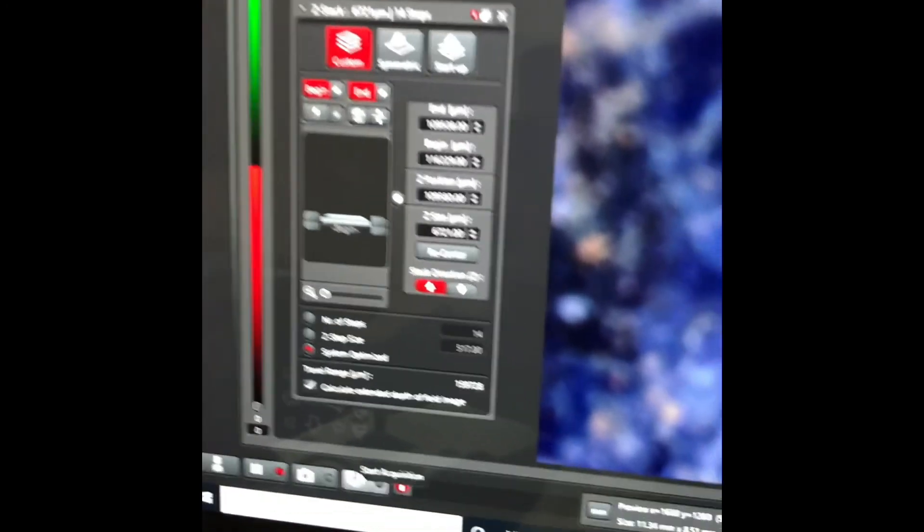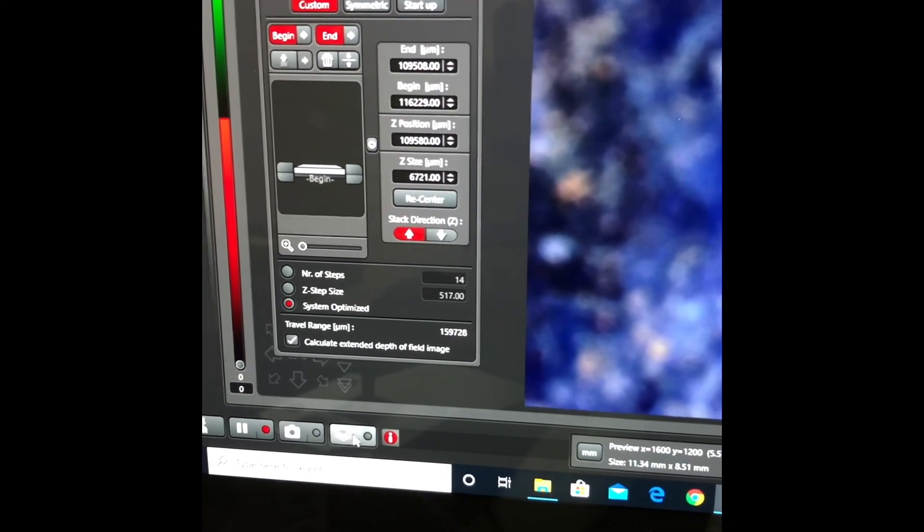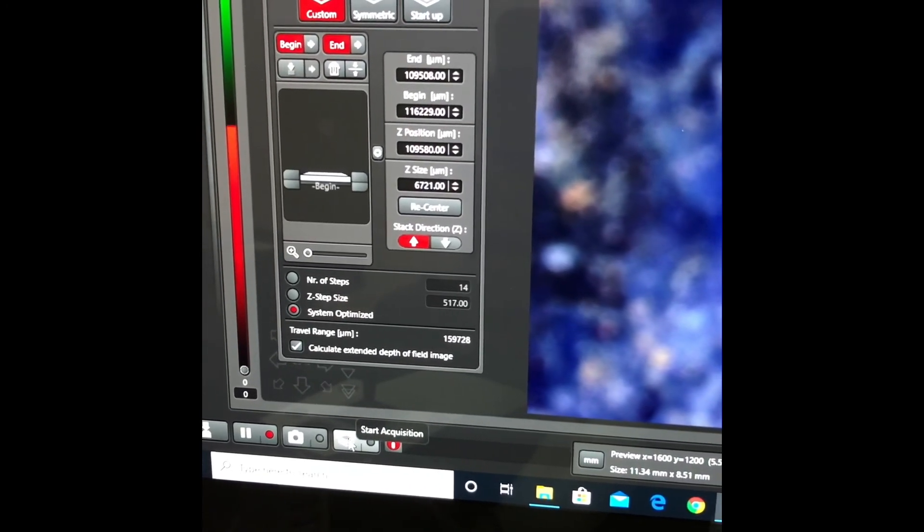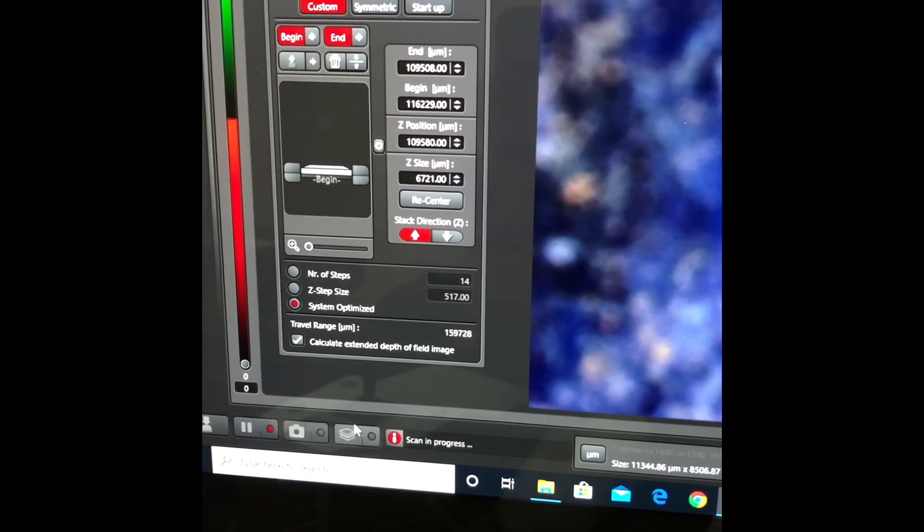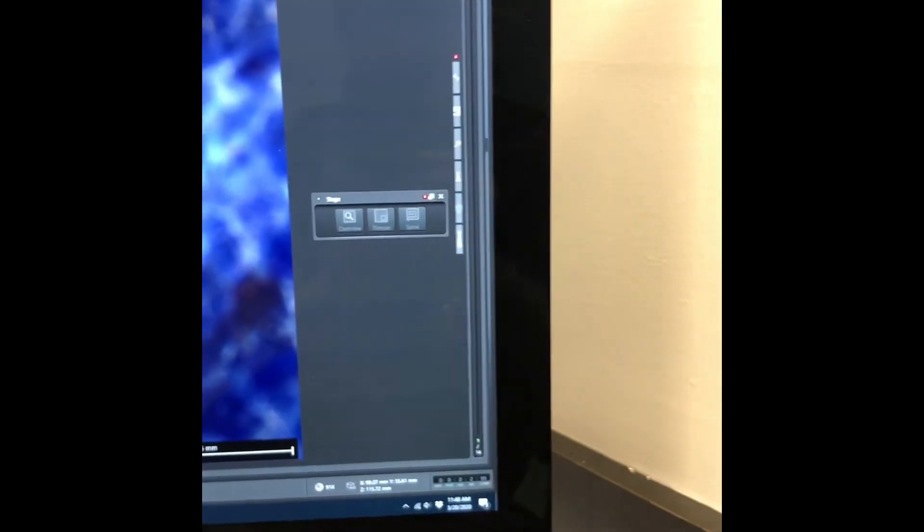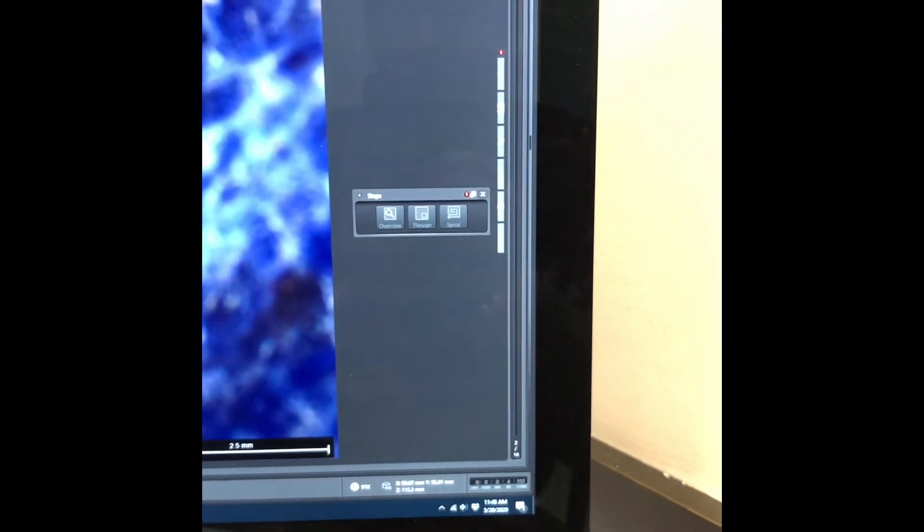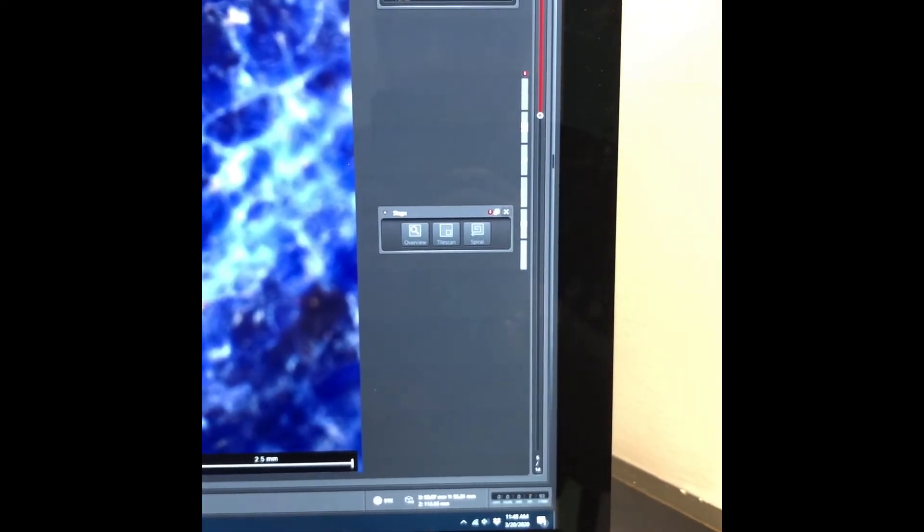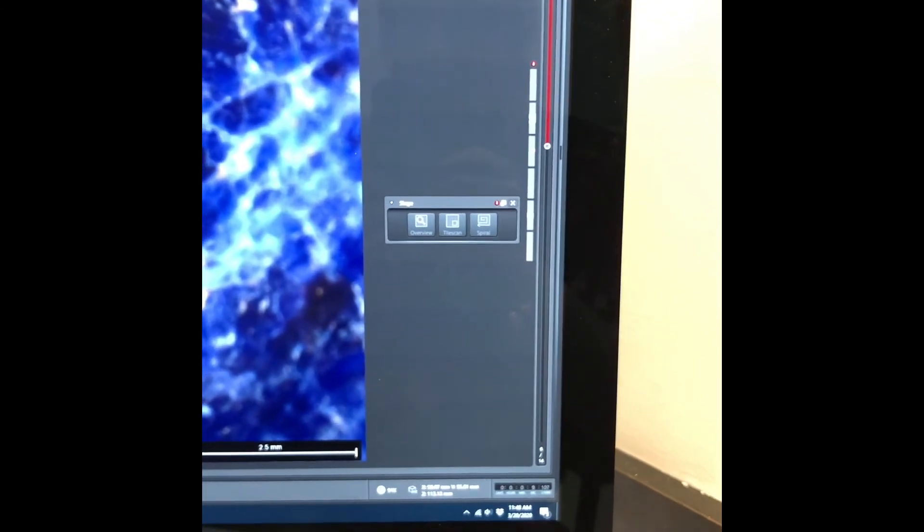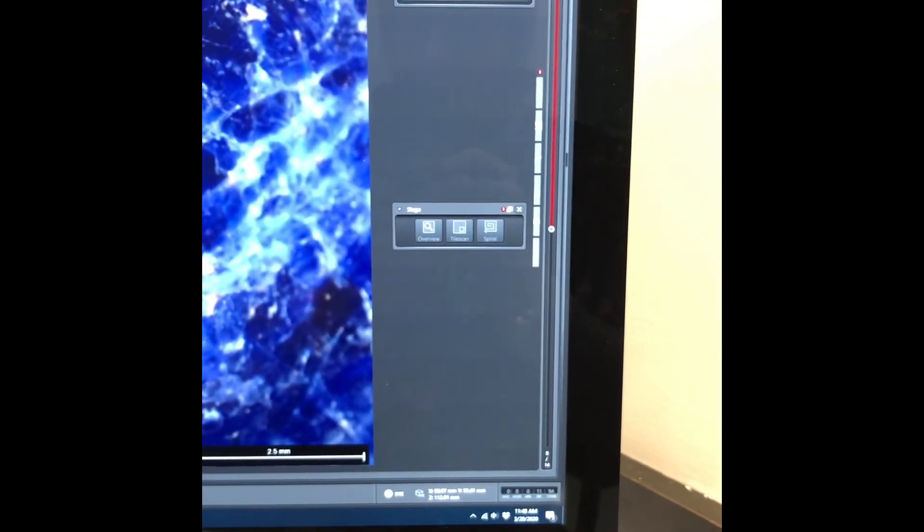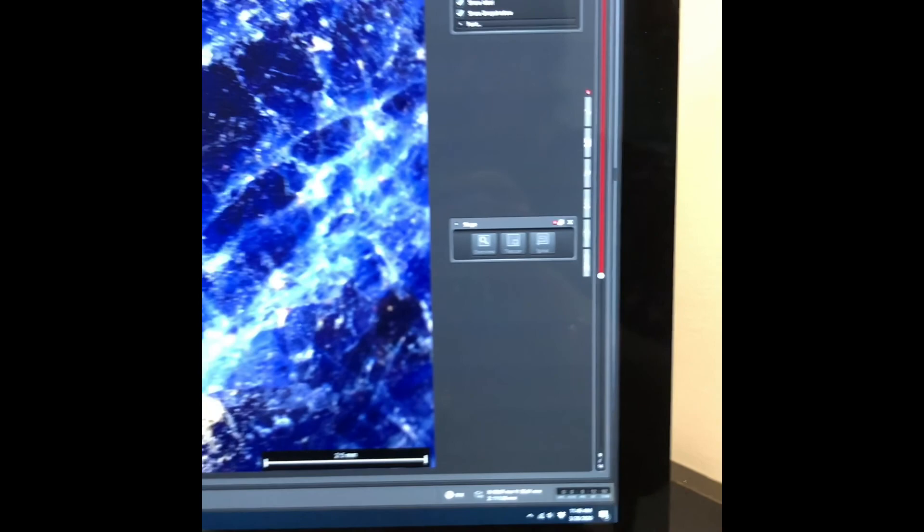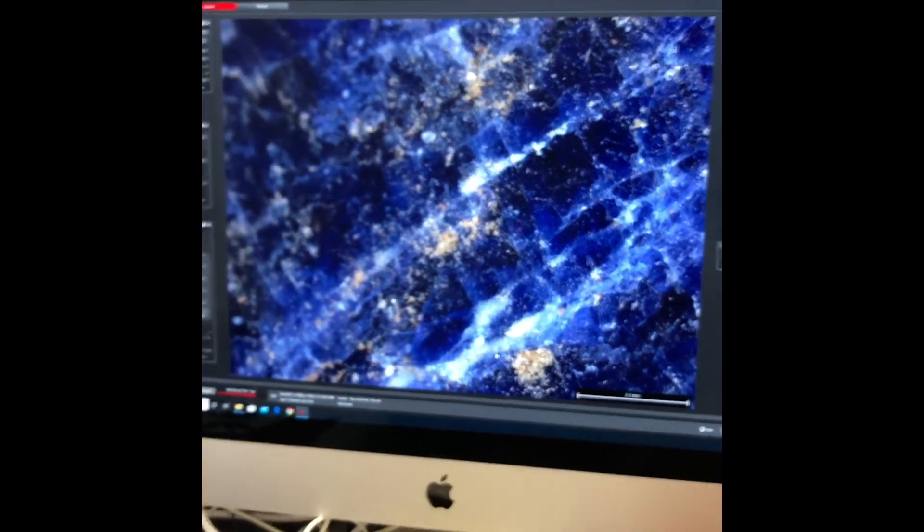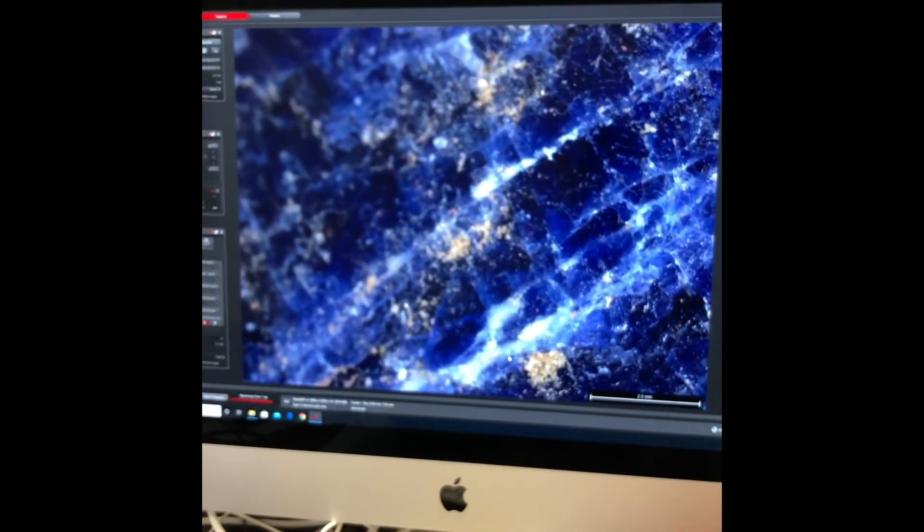Now we can press the Z-Stack tab at the bottom here to start our Z-Stack imaging. We can also track the progress of the Z-Stack on the sidebar here. You can see the progress is the red line getting larger. And now we just wait.